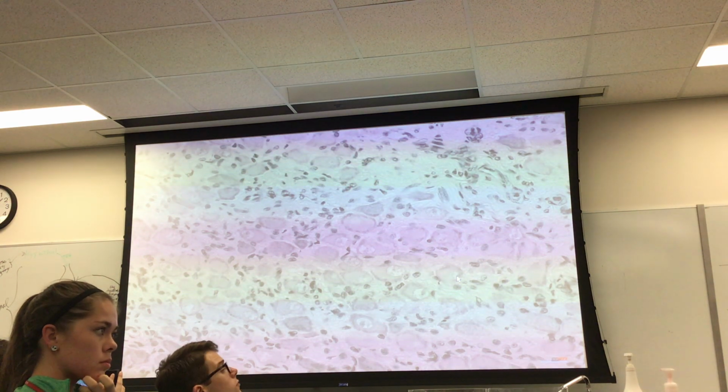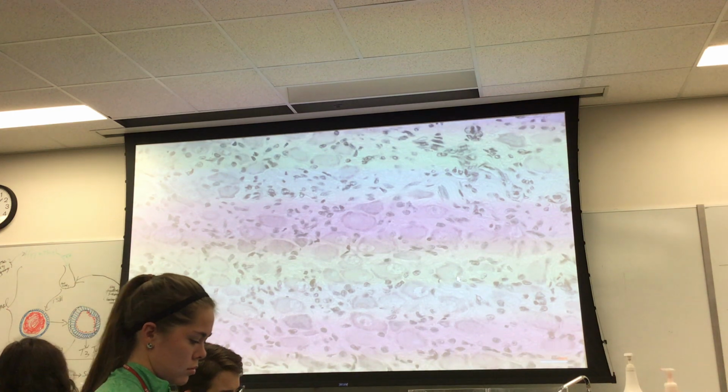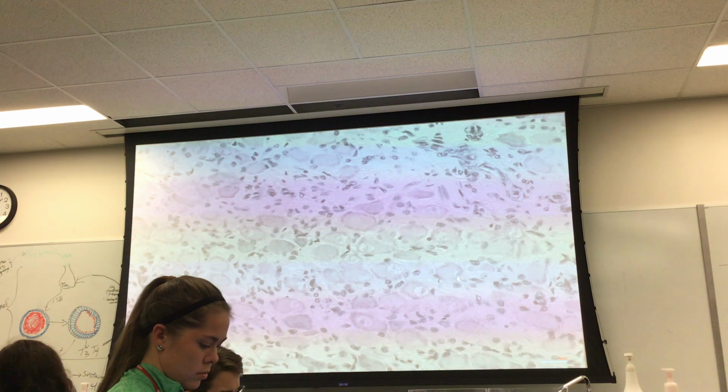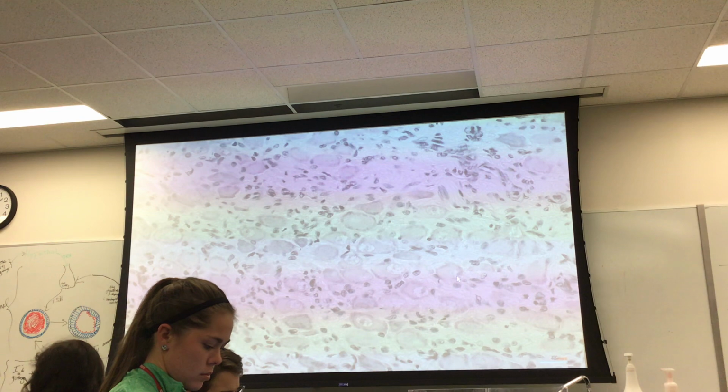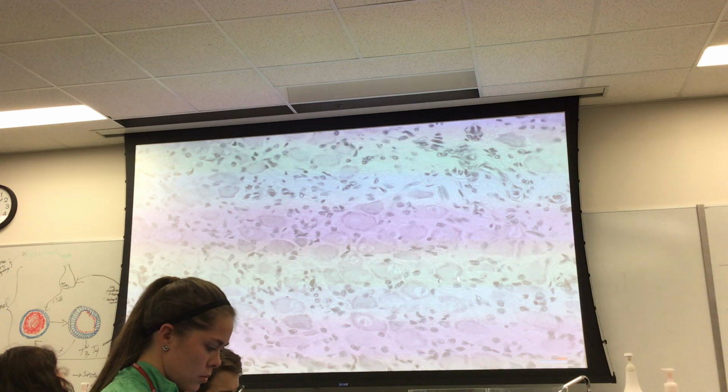Yeah, the question is, why can we be confident that's a dorsal root ganglion? I rephrased your question a little bit, and the answer is yeah, that's the only place you're going to see primary afferents. Now, the complete answer is there are ganglia associated with cranial nerves as well, where you can see primary afferents. They're the ones that deal with visceral afferent stuff that run with cranial nerves. We're not going to deal with that because that's head. Like I said, we're going to stick to from the neck down.